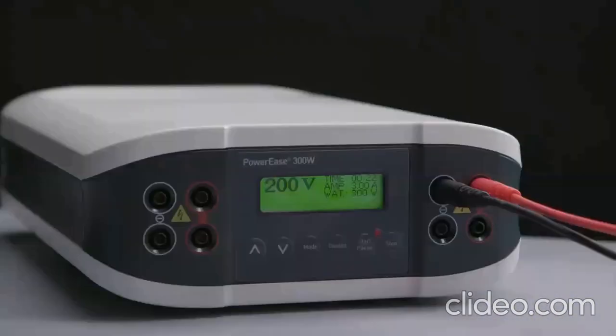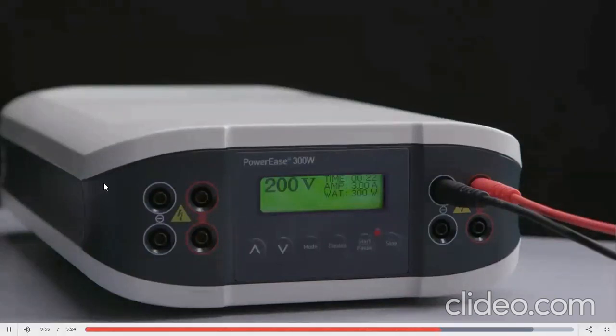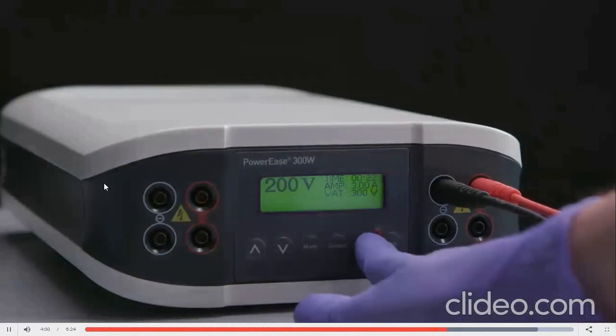Set the power supply to the appropriate run voltage and time. Bolt gels can be run at 200 volts and electrophoresis can be completed in as little as 20 minutes. Now, start the run. Bubbles appearing around the cathode indicate that the current is flowing.